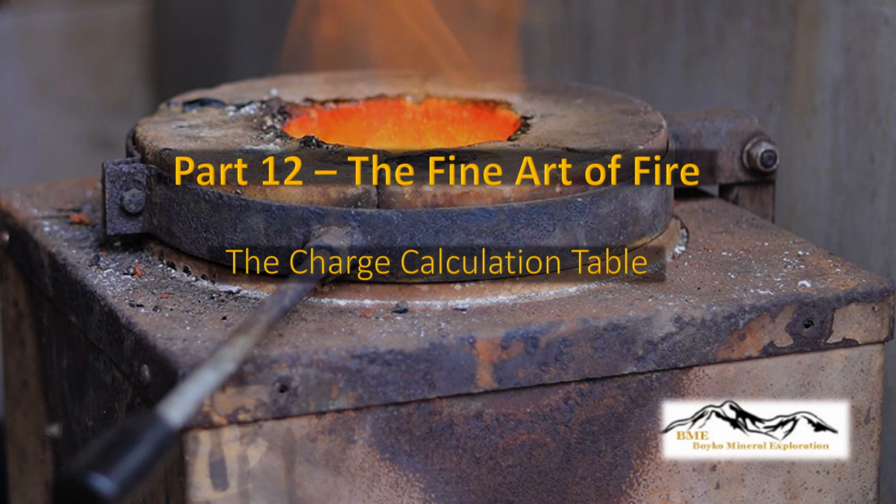In presentation 11, I discuss some additional methods of identifying what you may have in your ore concentrates. This is an important step towards being able to calculate the amount of flux constituents to add to the charge. That is, the ingredients that will be mixed with the ore material or concentrate, which in turn forms the lead button and the slag. In this presentation, I am introducing that charge table and how it is used.